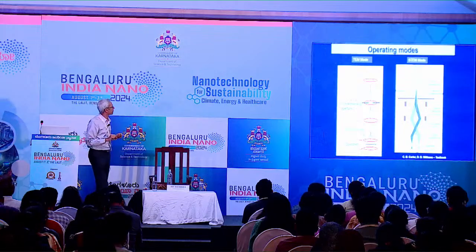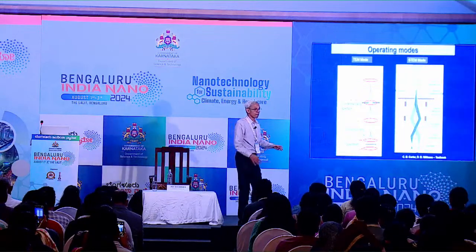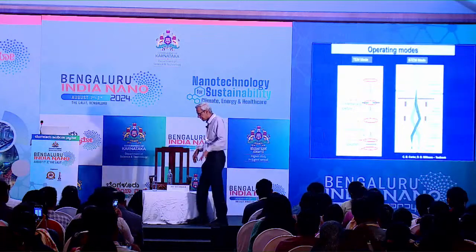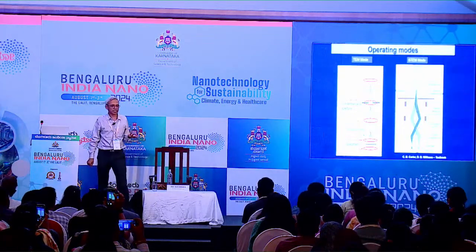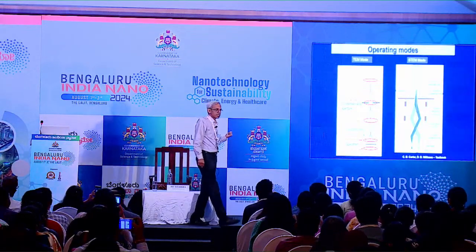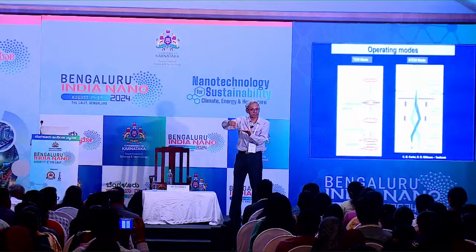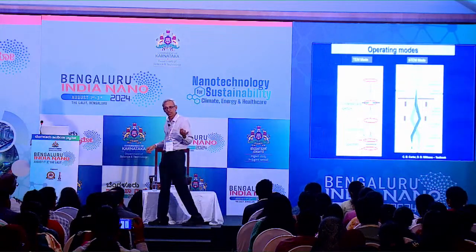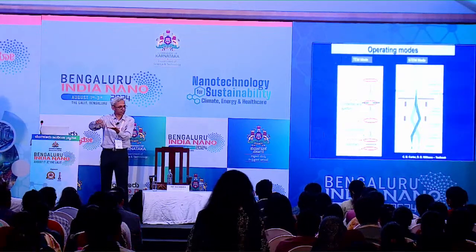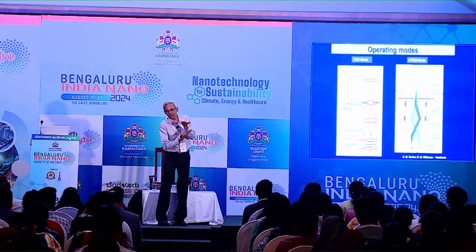There is yet another important difference here. So far what I have told you is what happens in a conventional TEM mode, where we have a parallel beam falling on the specimen, and then we have this angular intensity variation and so on. The second mode that is very common nowadays is the scanning transmission electron microscope mode, STEM mode. Here, instead of using a parallel beam, we use a finely focused beam that scans on the sample surface. If you have encountered scanning electron microscopy, the idea is very similar: we have a very fine probe that scans on the sample surface and we get the information. But the big difference is that we don't have a bulk specimen, we have a thin specimen, and all the imaging happens below.